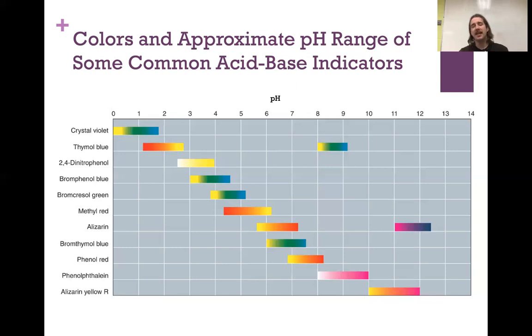It's just nice to talk about these and think about how they actually work and why we would use them and under what circumstance. Depending on what you're doing, they do work. They are fairly accurate, but it is a source of potential error. We use phenolphthalein all the time, for example, because it is pretty close to 7, and usually the pH changes really quickly. Even if it's just starting to change, it's only been the difference of half a milliliter, because you've only added 1 drop to go from a pH of 7 to a pH of 10. It still works because of how quickly these pH changes occur. So pros and cons, it kind of depends what you're doing, but this is how our indicators work and how we see their different colors exhibited in our different solutions.